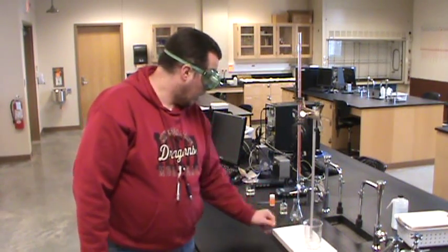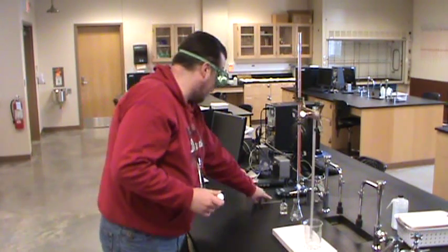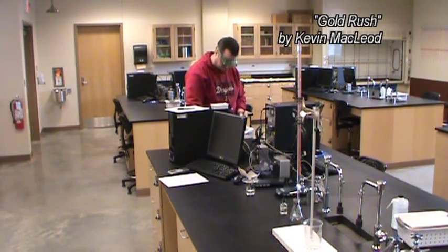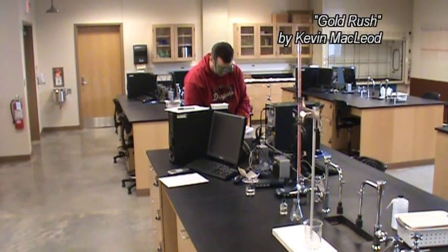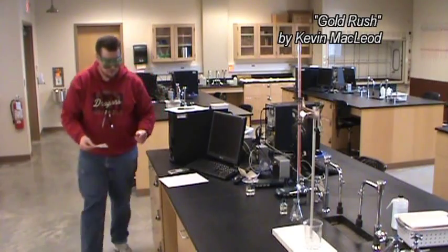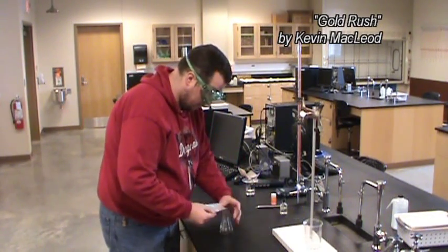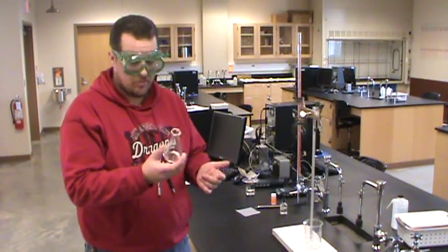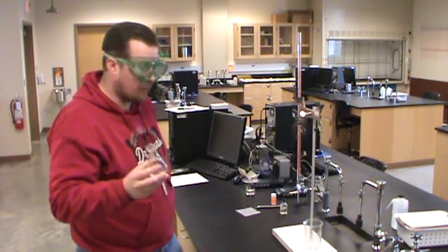So, I need to weigh out some potassium hydrogen phthalate to do that. When I weighed this out, I got a little bit over the 400 milligrams that the manual says, and that's fine. I actually weighed out 421 milligrams, and all that really matters is that I know how much I used. So I can go ahead and use this 421 milligrams. Let me write that down before I forget it.